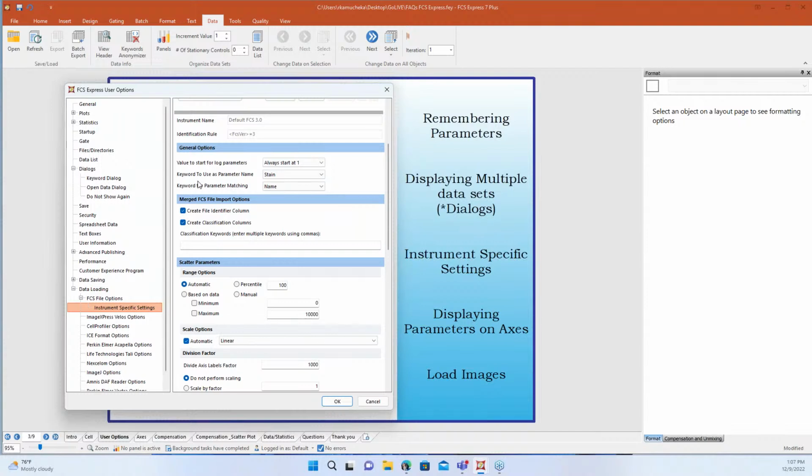Now, most importantly, I get this often: I'm displaying my parameters on the axes, but it's not showing my antigen, or it's not showing my fluor. Here is where we would modify that. Using this drop box, we can use name. Name is from the instrument, so this is just how the instrument has named a detector or a filter, whatever is named from the instrument is going to be shown here. Stain is anything that the user inserts into their acquisition software. And then name and stain, or stain and name, is just prioritizing: do I want the name first and then my stain, or stain and then name? I can organize that however works.